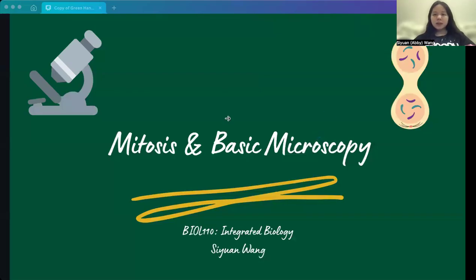In this presentation, I will introduce mitosis and the basic usage of the microscope, which was the lab session I did in Biology 110 at Duke Queensland University. The main focus will be on mitosis. I'll first introduce the background information based on what I've learned about mitosis in this course. Then I'll explain the steps in this lab experiment in detail. Finally, I'll discuss how mitosis is related to the real world.